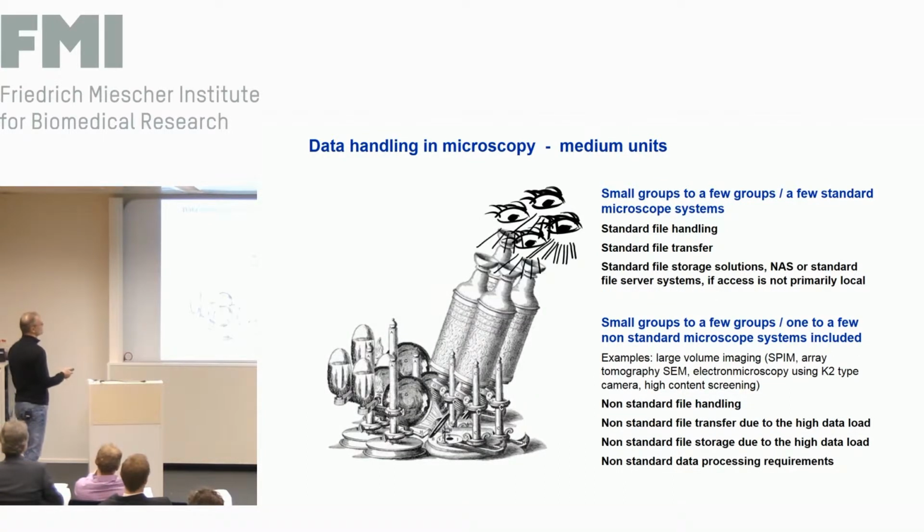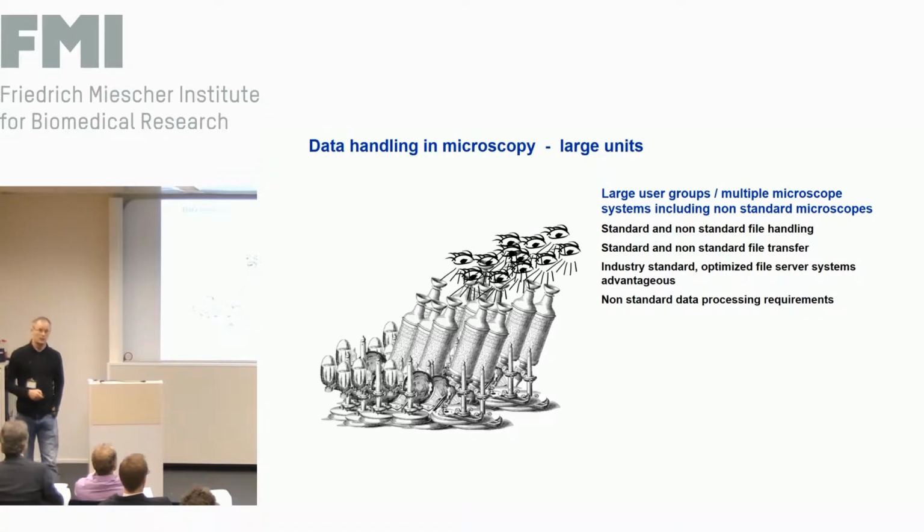So you may have small groups, a small core facility, for example, and you may have standard or non-standard microscope systems. But let's switch immediately down here. That's actually the situation I think we have. We have a relatively inhomogeneous and a large user group. We have multiple microscopes, so you have all the flavors, basically. It's non-organized. Personally, I don't think about file formats anymore, because I think it's basically a waste of time, because you get everything from companies, so you have to live with it. That's the situation we deal with.